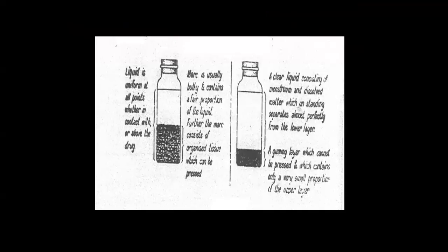When you compare the organized drug and unorganized drug, the organized drug takes up the menstruum and gets bulged, and most of the menstruum or solution within the space is retained; that's why it is bulged. Whereas the unorganized drug won't retain any of the menstruum. The menstruum passes through, takes up the active constituent, and immediately the solvent you poured becomes a solution. So in this case pressing the marc is not required. Even without pressing, we can get the maximum amount of extract.